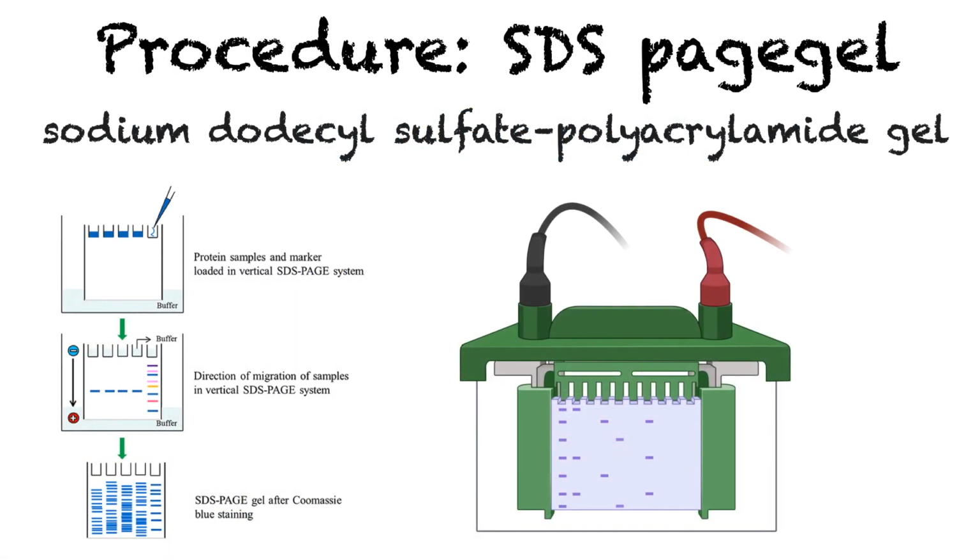So another one is SDS gel. SDS gel is a bit different from the agarose gel, but we do not need to worry about the setting of the gel because they are commonly available in the market in ready-made form. So we have to take care during removing the comb.